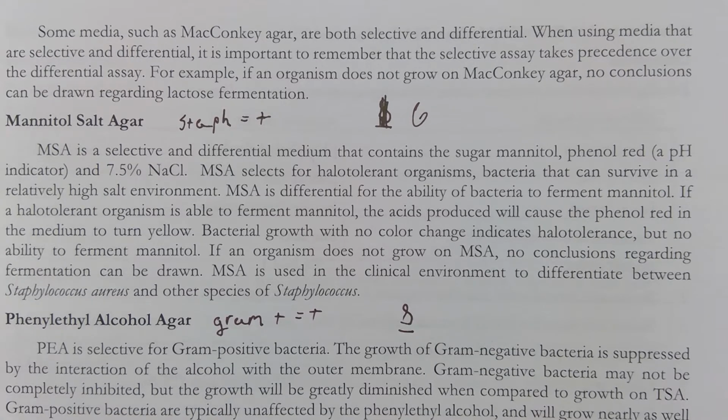MSA is a selective and differential media that contains the sugar mannitol, phenol red, which is a pH indicator, and 7.5% sodium chloride. MSA selects for halotolerant organisms, which are bacteria that can survive in a relatively high salt environment. MSA is differential for the ability of bacteria to ferment mannitol.